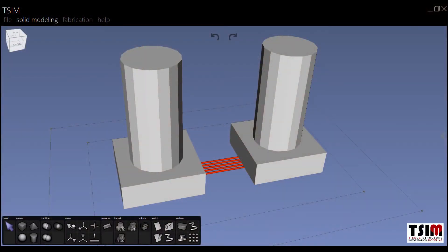In this particular example, we'll be using the TSIM VAB bioprinter system to construct a microfluidic device.